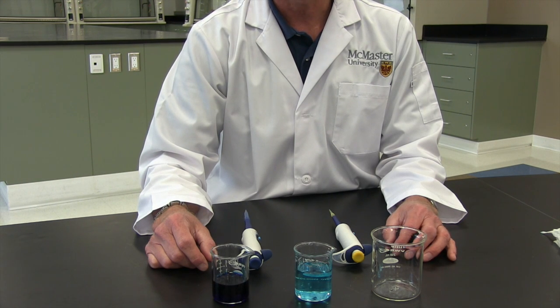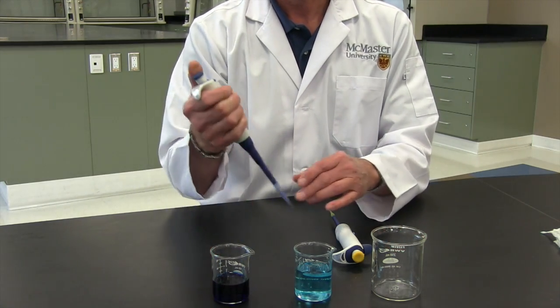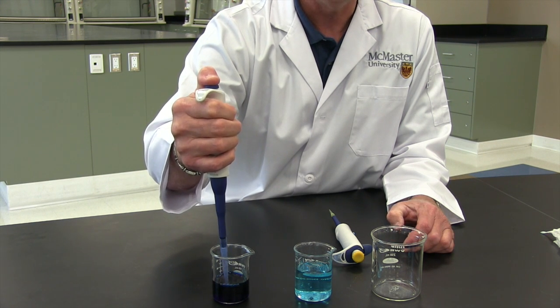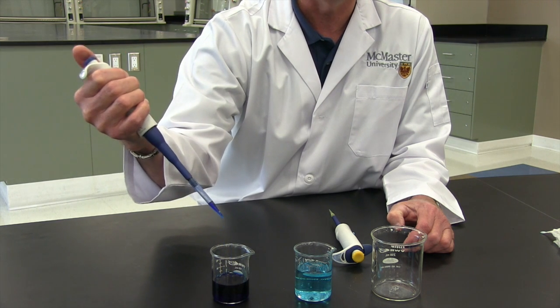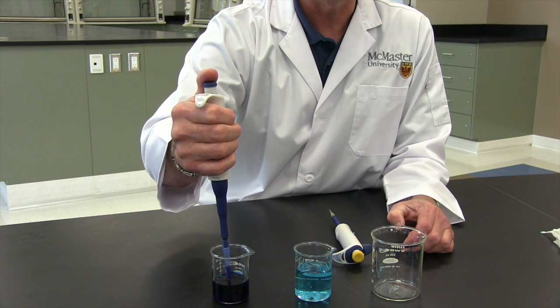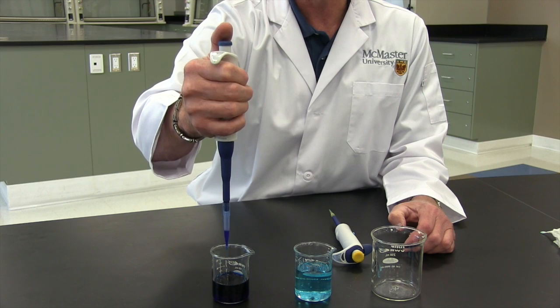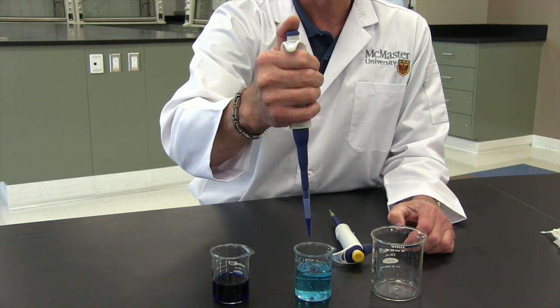There's a few common errors that can happen with the micropipette that you should try to avoid. One of them is putting your tip underneath the surface and then pressing down on the plunger. And that just creates bubbles within the liquid and may cause inaccuracy when you're drawing up your liquid. Another error is to draw up your liquid and turn your pipette sideways or even upside down. Your pipette should always be vertical when you're going between beakers or test tubes.